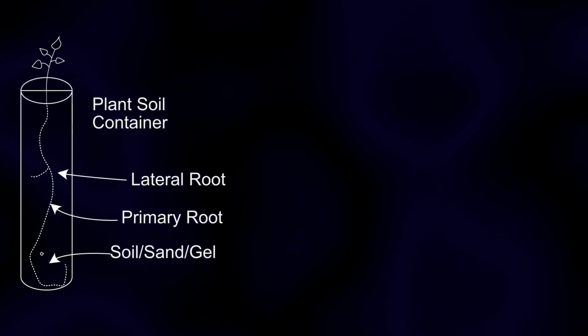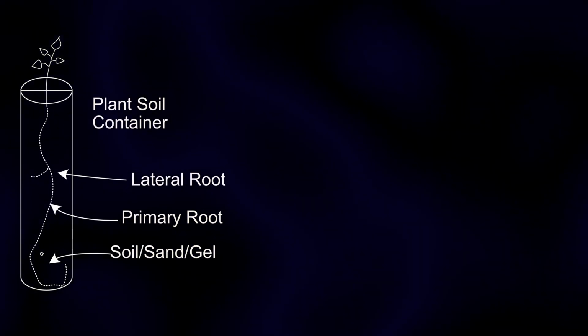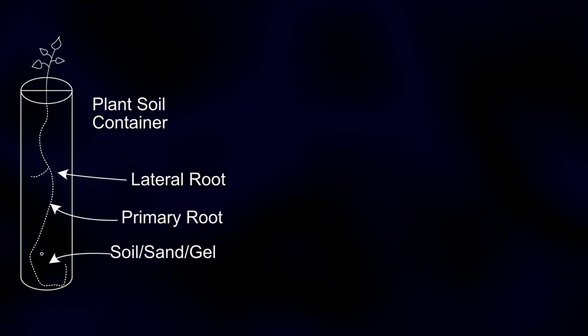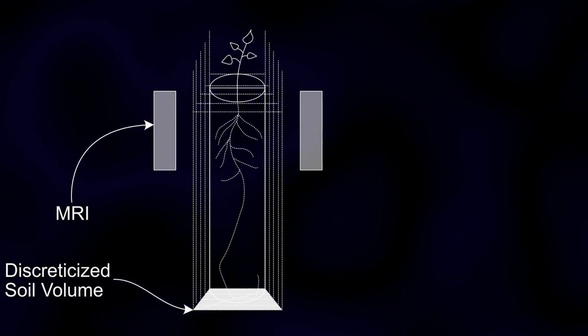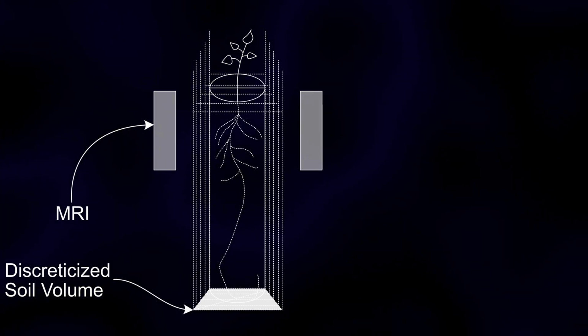Plant roots are quite obviously more difficult to observe than the shoot part of the plant, but roots are just as important for the function of the plant. This has been extensively studied, and our main point of observation is 3D images from plant and soil columns. These are non-magnetic tubes in which, for example, sieved soil is filled and a plant is grown for a time. We scan these soil columns using different techniques, most notably an MRI scanner.